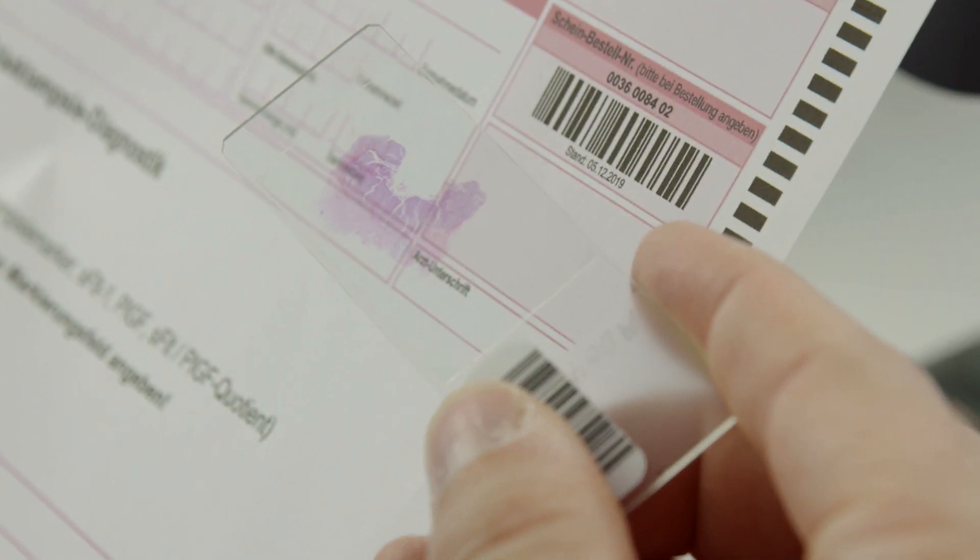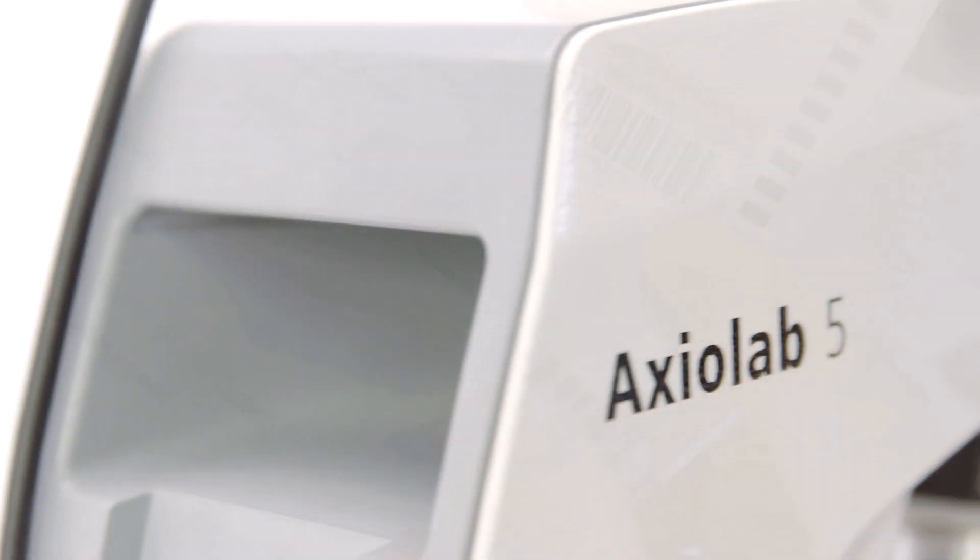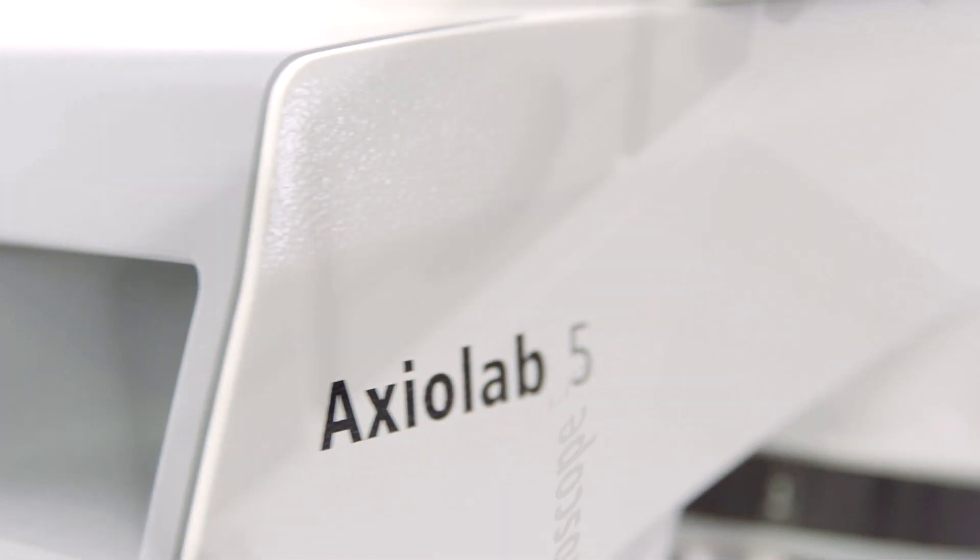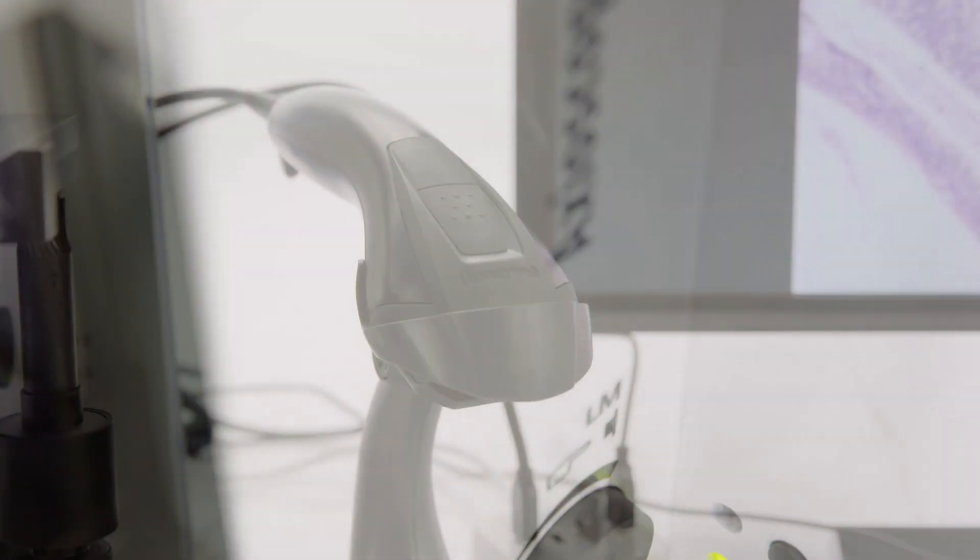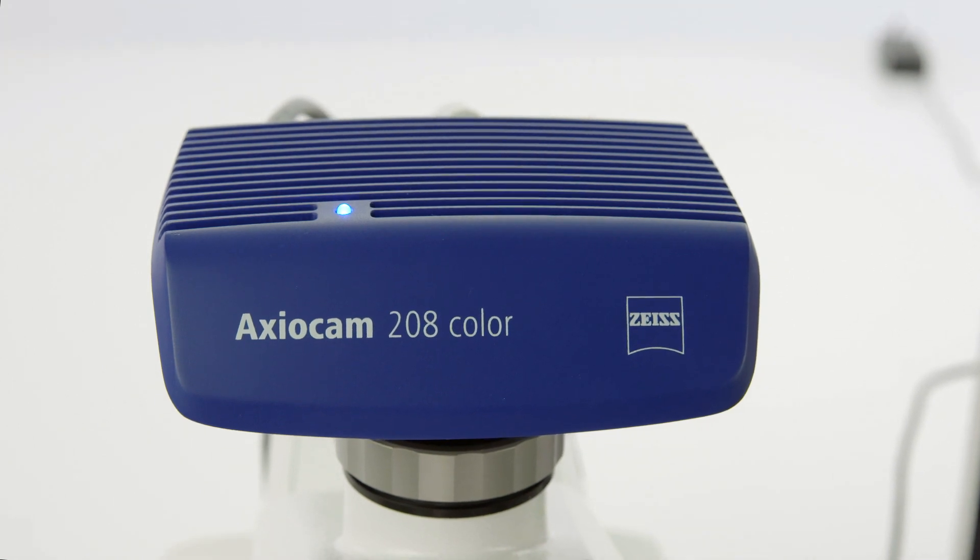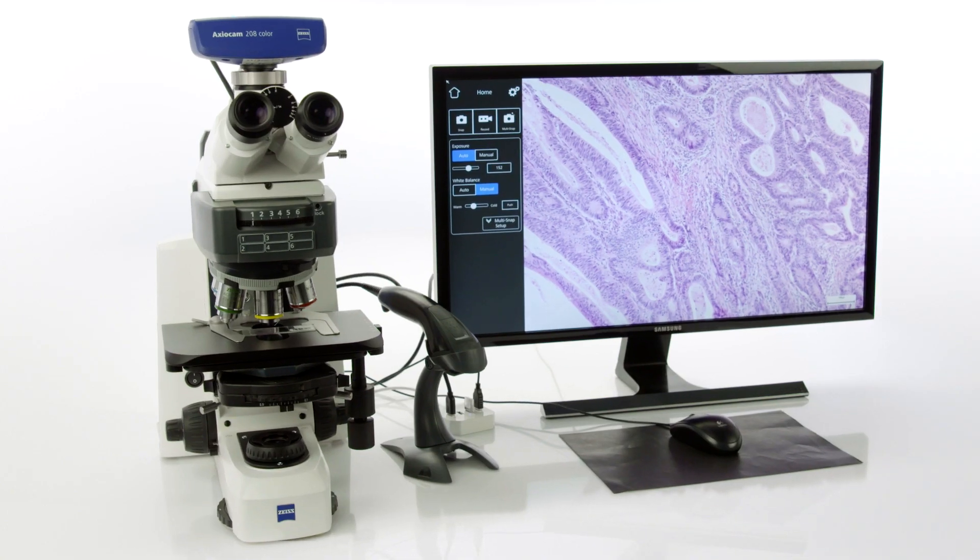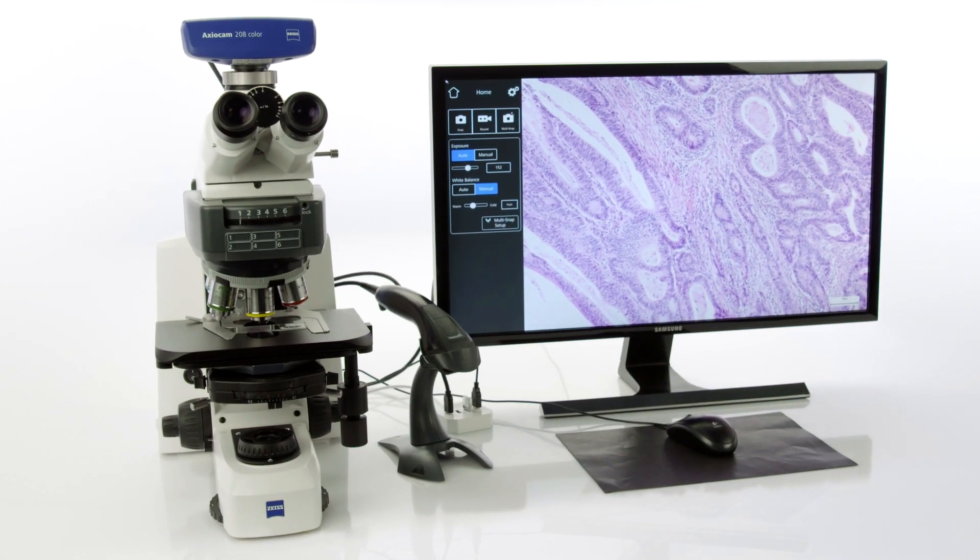You don't even need a PC. Just use your Axiolab 5 or Axioscope 5 microscope, connect a barcode reader to your Axiocam 208 color microscope camera, and you're good to go.